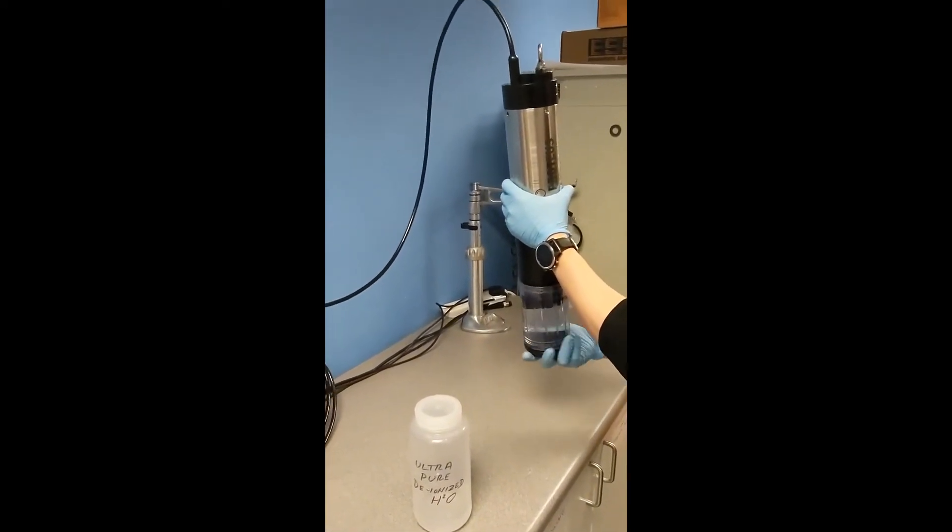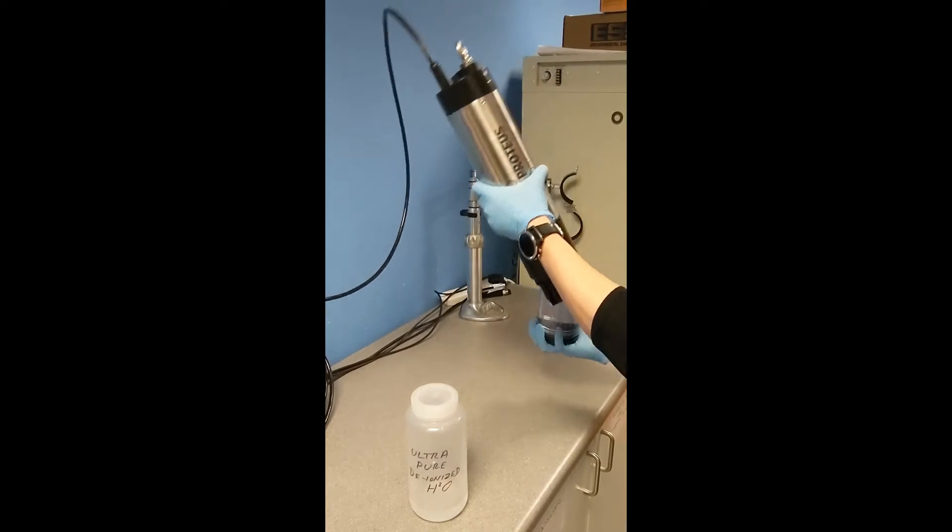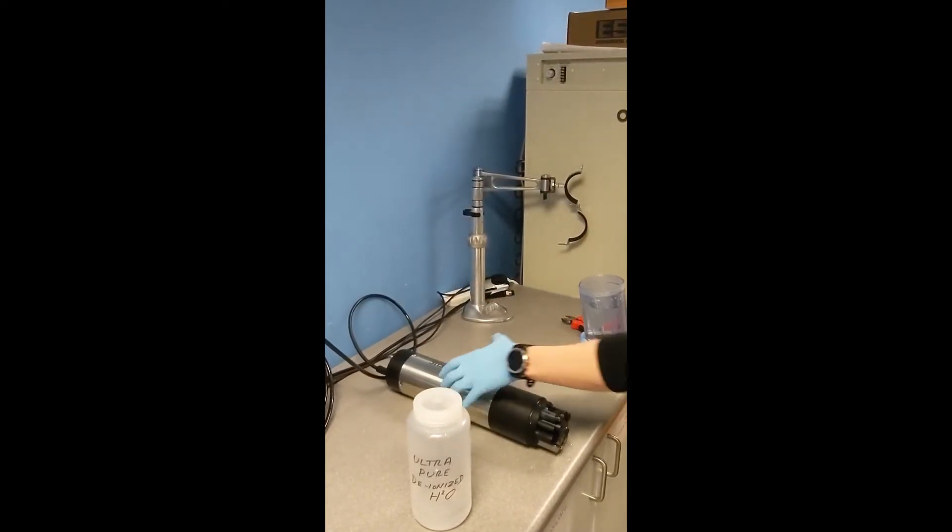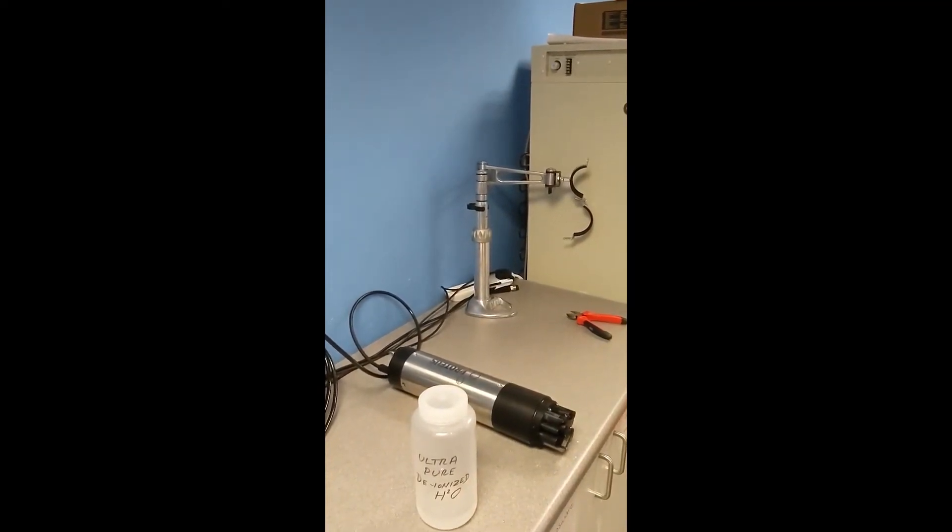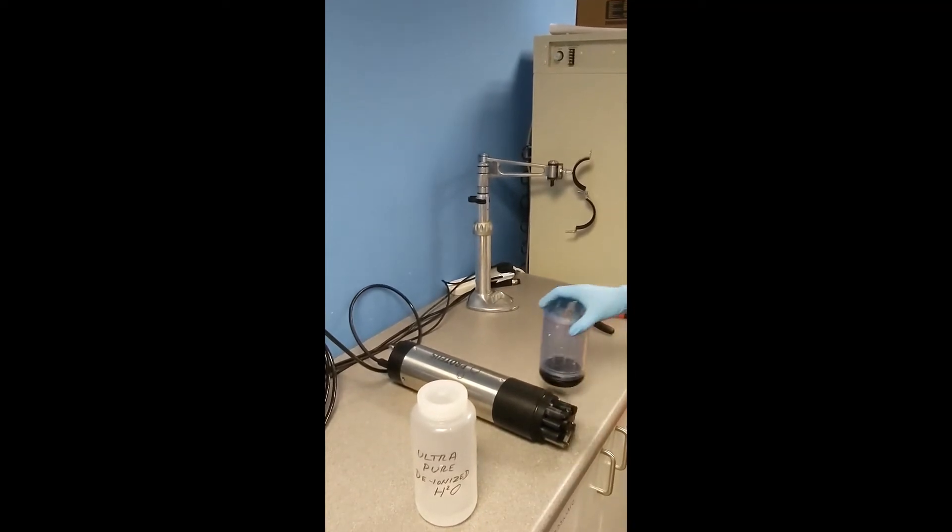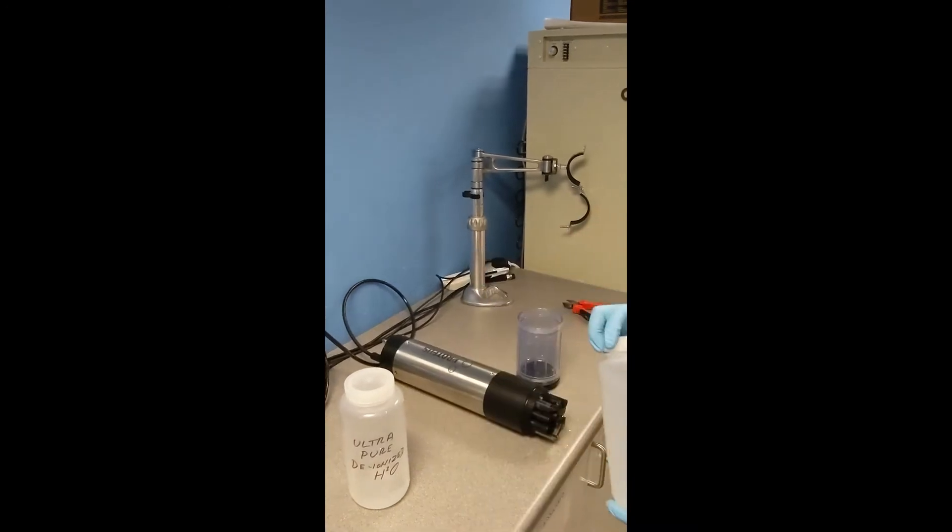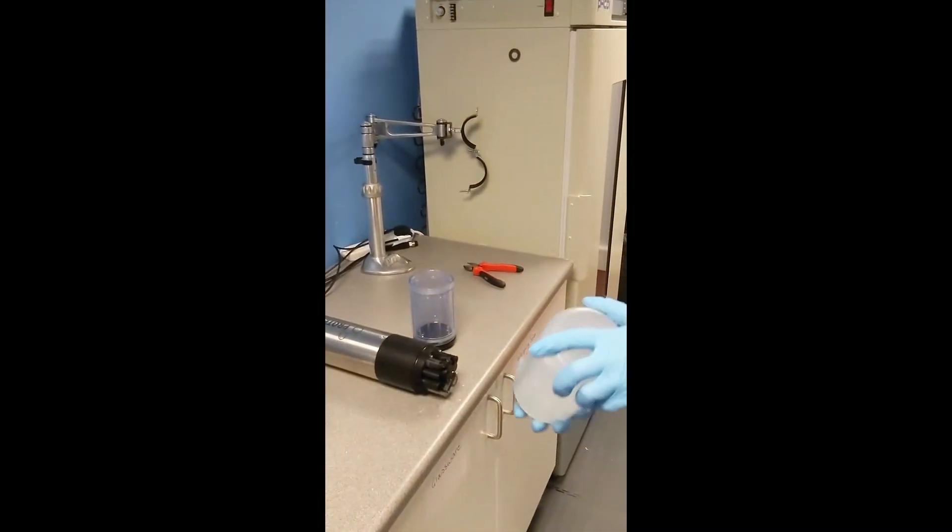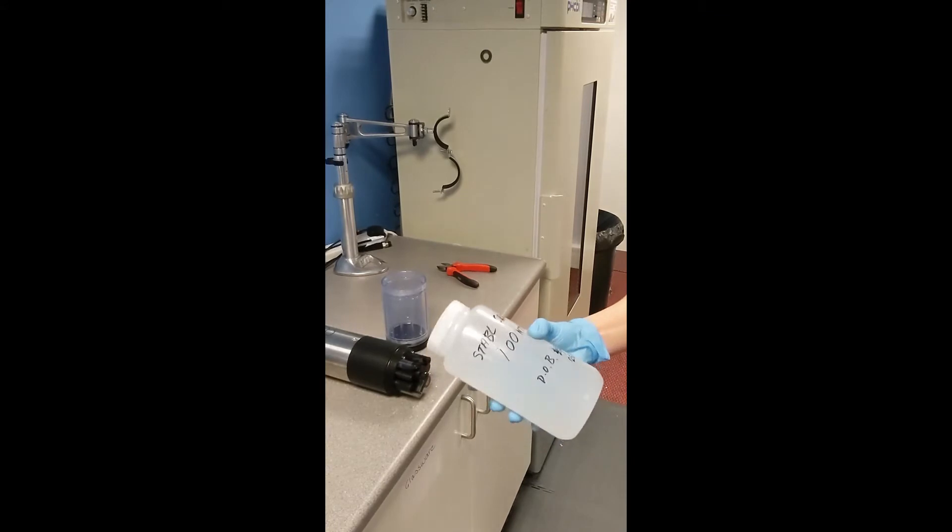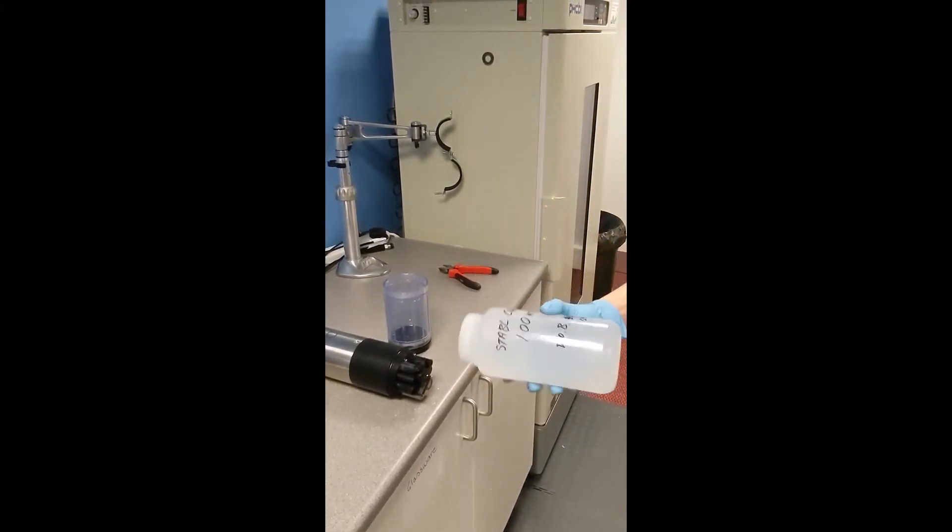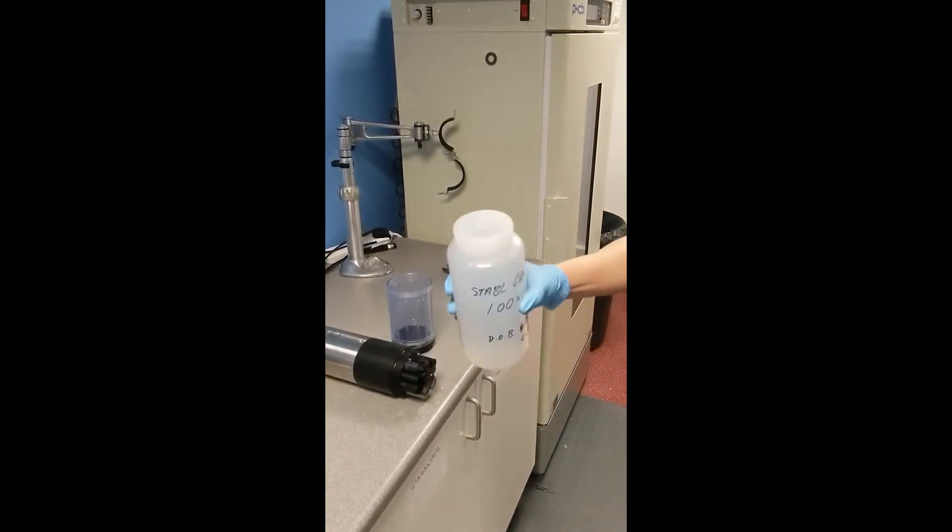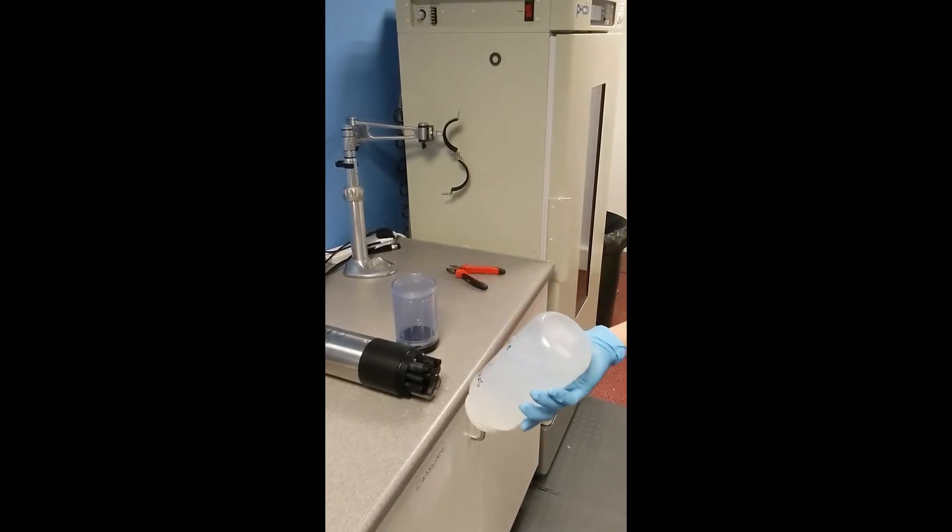So we need to empty the zero fluid. Here we have some stable cal that we've mixed up before. We need to invert it. This is formazin stable cal and it's the most reliable turbidity calibration fluid available at the moment.